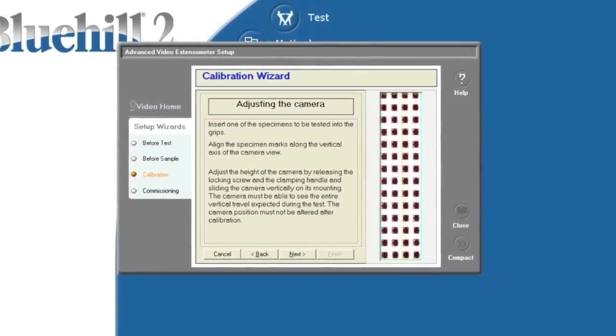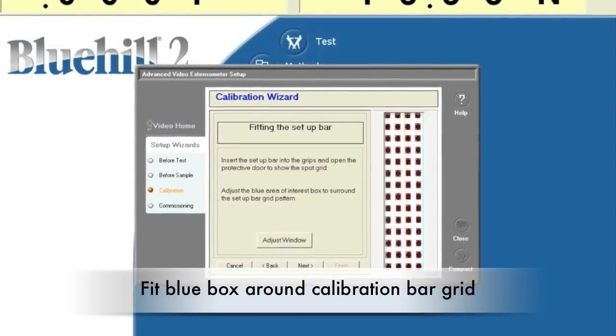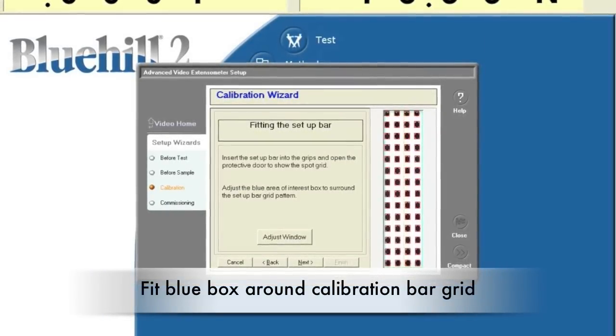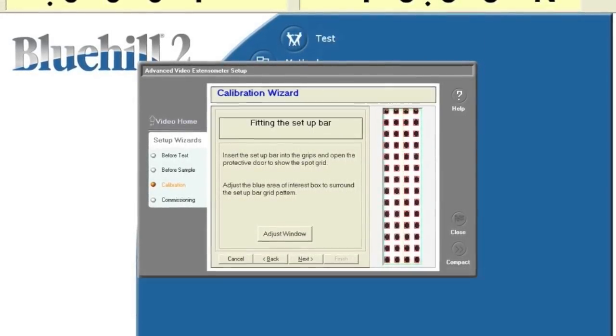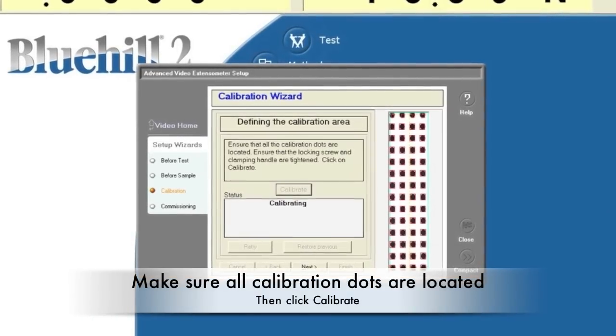Loosen the handle and screw to move the video extensometer up and down. Open the calibration bar's protective window to show the spot grid. Move the blue box to fit around the calibration bar grid. Make sure that all calibration dots are located with red boxes and click on calibrate.